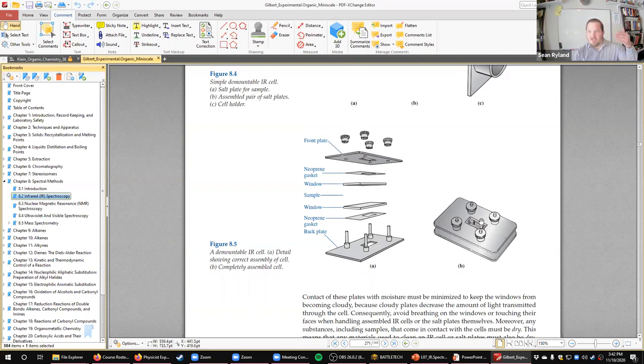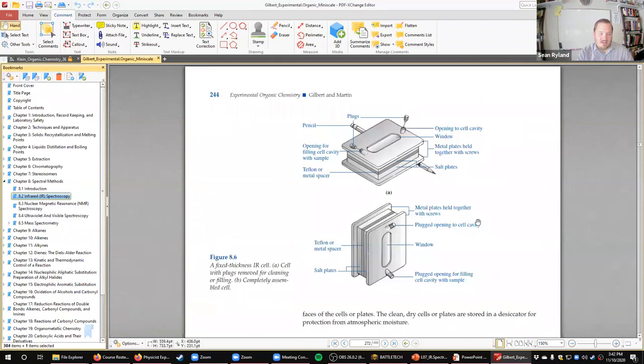It's a lot like, remember measuring absorption when you did equilibrium last year and you looked at how strong the color was to determine what the concentration was? Does that sound familiar? And you had to have a calibration curve, and it's usually a red or a purple depending on what lab you're doing. And the more intense the color, the more concentrated the sample. The apparatus looks a lot like that. It was those big beige boxes.